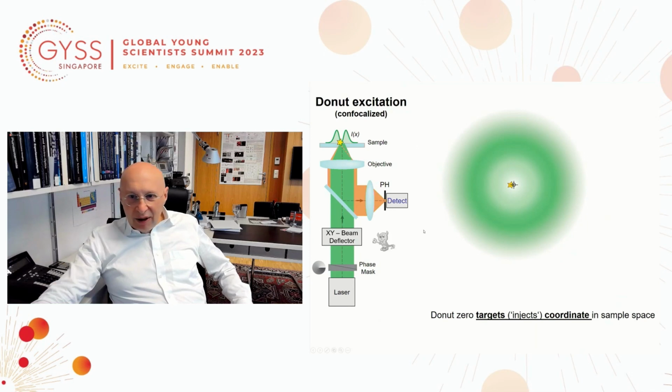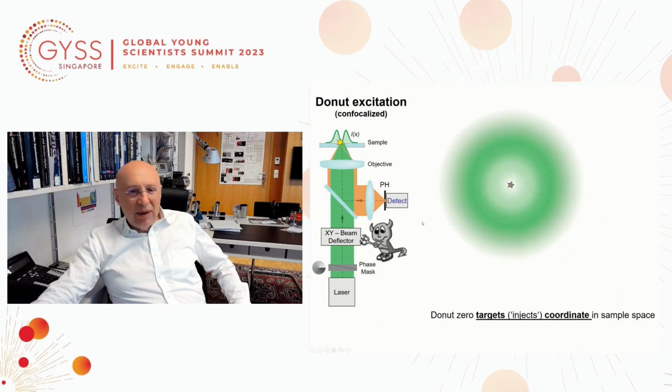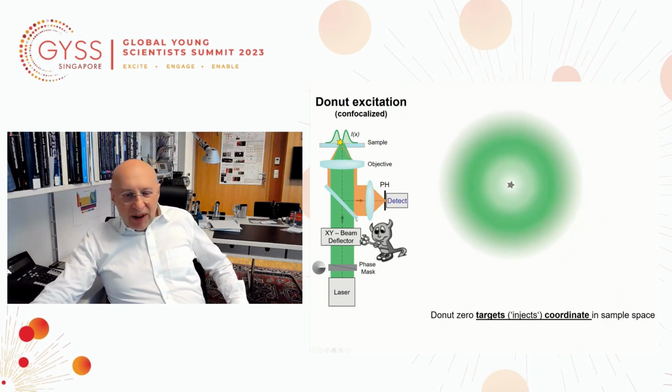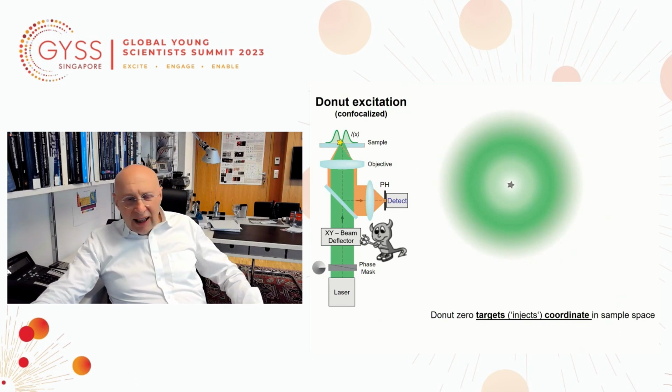So we don't need a pattern of light or something that we measure, just plain photons, brightness of the molecule. And I'm telling you now why this concept actually saves a number of detected photons. Why is this concept so powerful? In order to explain this to you, I decided to introduce a demon. It's kind of like Maxwell's demon. And like all demons, the demon knows something that we humans wouldn't know.